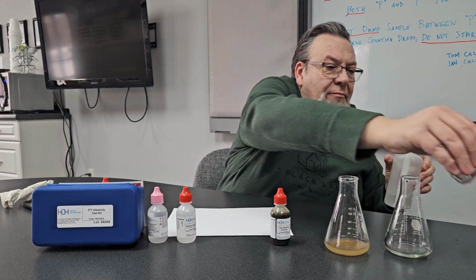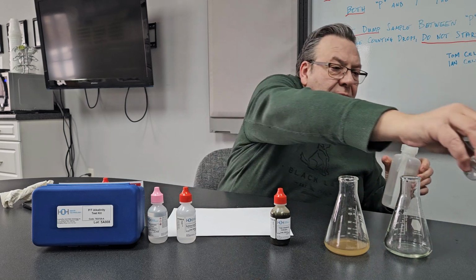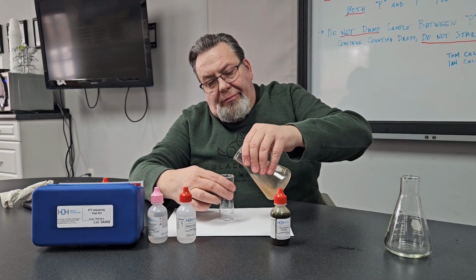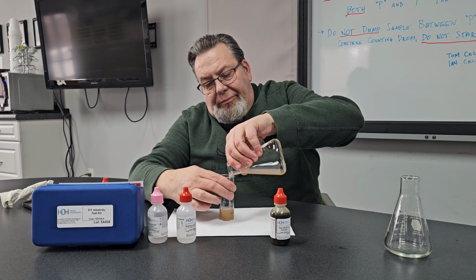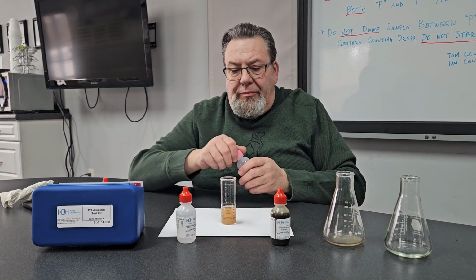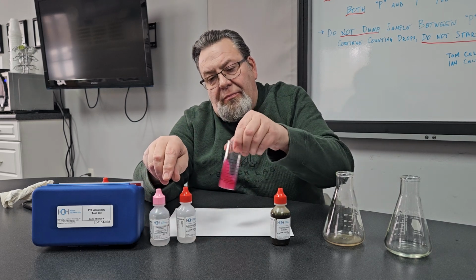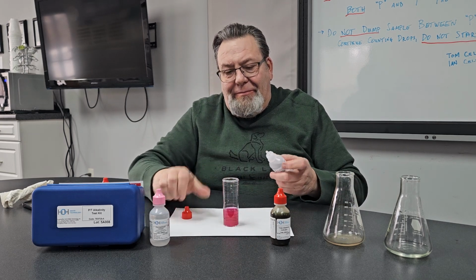Now to demonstrate the color change when you're using a sample that has a higher amount of boiler solids, Ian will do the exact same test. 25 milliliters of sample into a well-rinsed vial. Three drops of phenolphthalein. Looked like he accidentally put an extra one in there, but that does not affect the outcome of the test. Counting each drop.